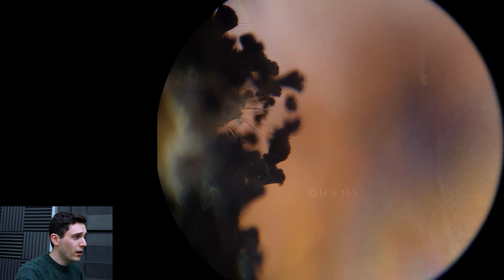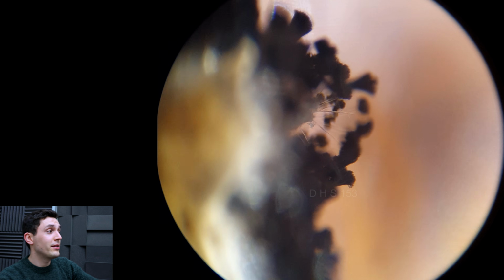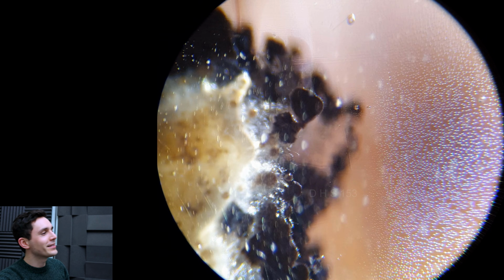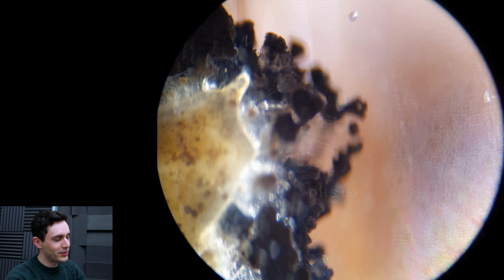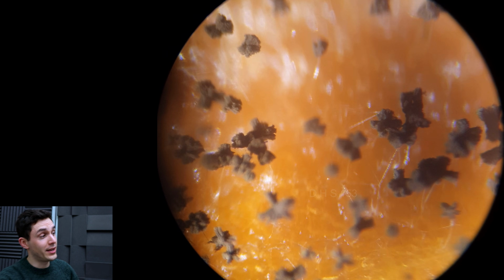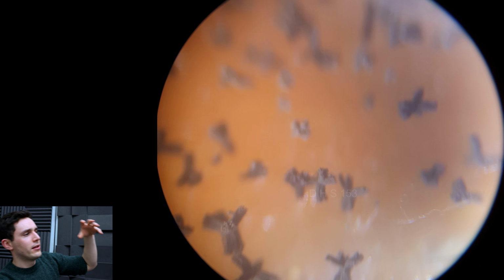I hope you found this update interesting. It's still in the clinic, still there, just happily growing away. I will probably have to throw it away at some point, but I thought that was a very interesting update to a video I uploaded ages ago, and a lot of you guys have been asking me about it, so here it is. Here is the clinic colony of Aspergillus niger.